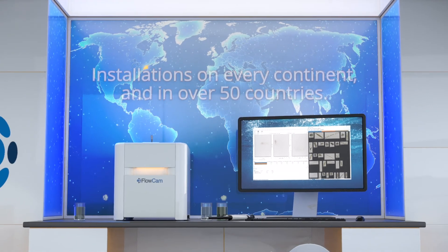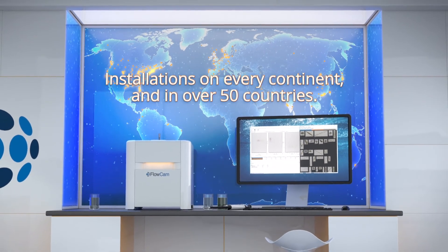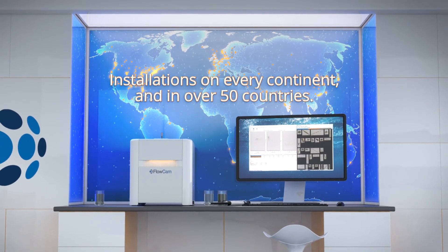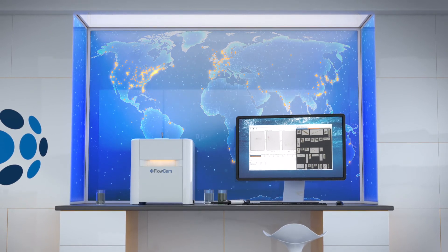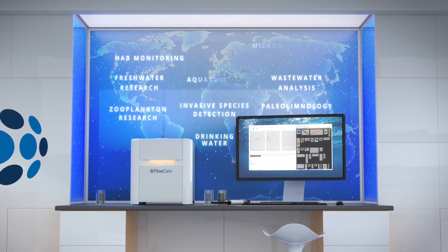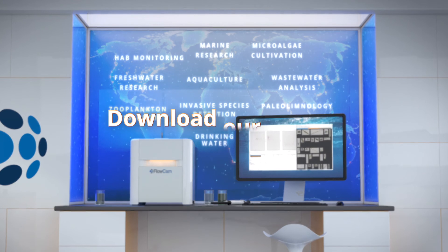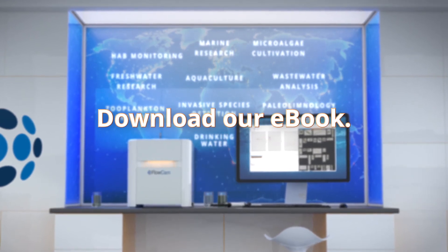Labs all around the world are using the FlowCam to streamline the process of algal analysis. If maintaining healthy water systems is important to your organization, download our ebook to learn more.